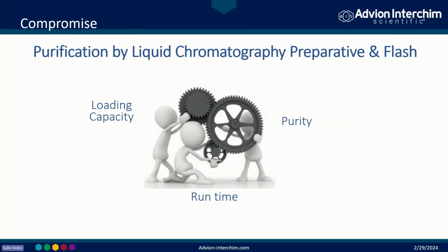Purification in liquid chromatography is always a question of compromise. You must take into consideration for each run the loading capacity, so you need to purify the maximum quantity in one time. You need to achieve the needs in terms of purity and the run time, because you need to purify as fast as possible.